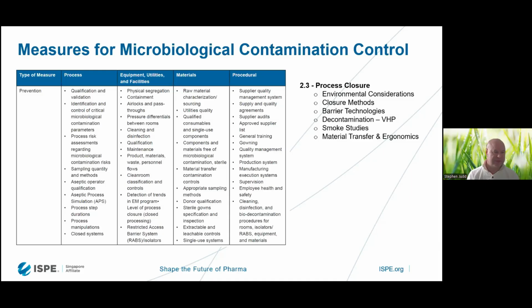Small facilities with a lot of small segregated rooms, a lot of grade B environments, operating in grade A biosafety cabinets. One of the assumed challenges was that because you're working with small bench scale operations, the tactility of isolator technology was not there to allow you to perform these delicate operations within an isolator. So that led to higher grade clean room environments and operating within a BSC.